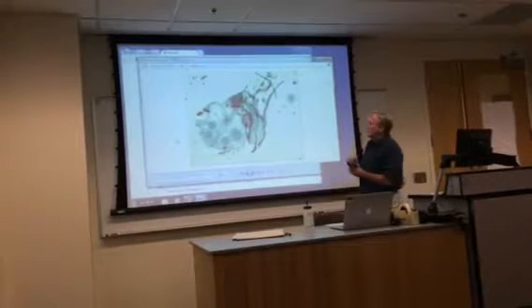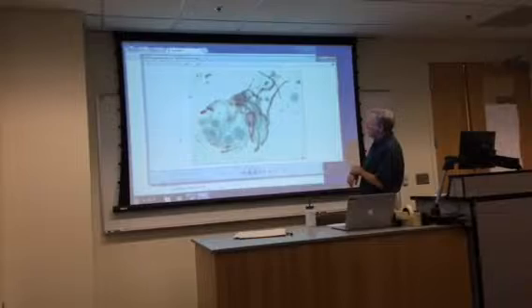Now we're moving on to leafy liverwort. It's the last one I think I'm doing, except sphagnum. I got a couple of those.